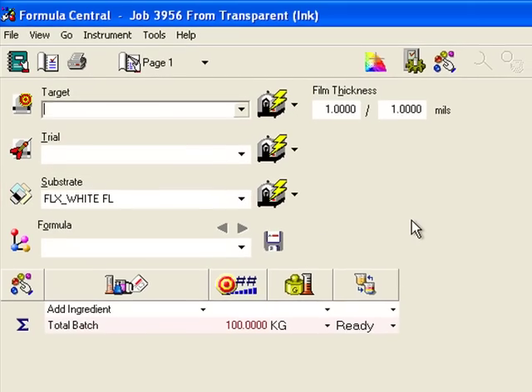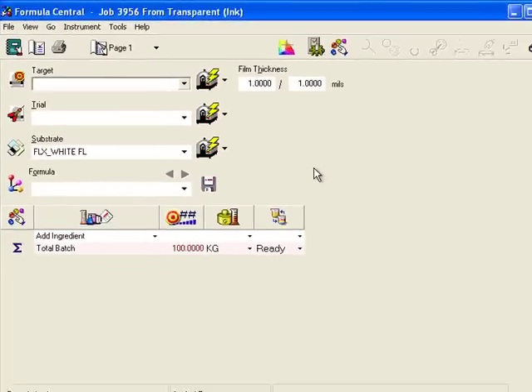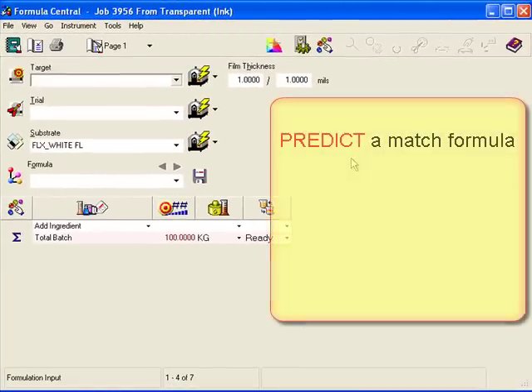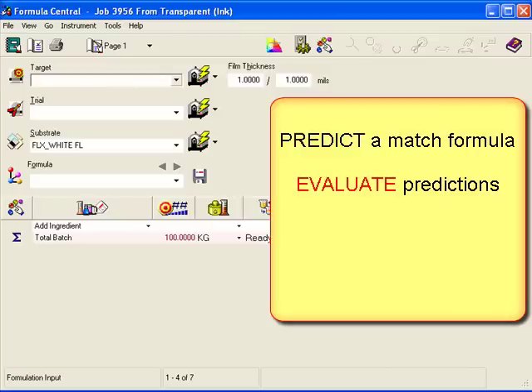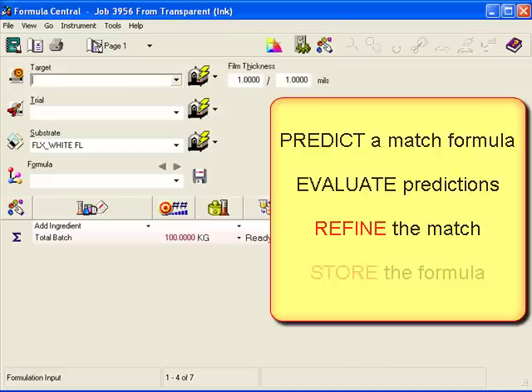We will look at different templates and options later. For now, let's concentrate on workflow: predicting a match formula, comparing and evaluating the predictions, correcting and refining our match, and finally, storing a successful formula.